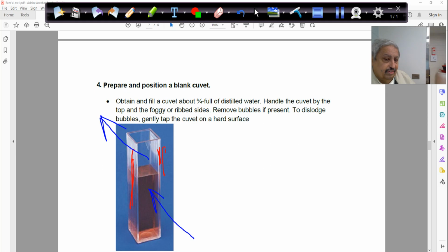So you'll fill it first with the calibration with your H2O. You have to calibrate it with distilled H2O, correct? Can I use tap water here? Yes or no? No, I can't. I have some ions inside the H2O, which might interfere with my absorbance. So you just follow those steps as very straightforward steps here.